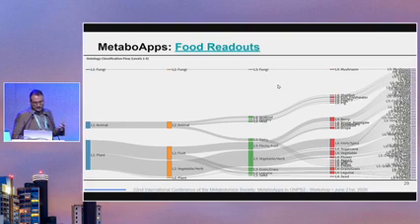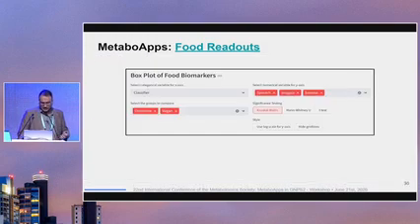So you're going to see fungi, seafood, poultry, meat, dairy, fruits, vegetables, legumes, seeds. And on level 5, you're really looking at the specific food. Of course, we're not considering all types of varieties for those, but the broader classification. So if you have any type of garlic, that's what's going to populate on level 5.